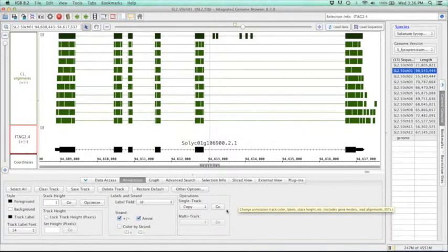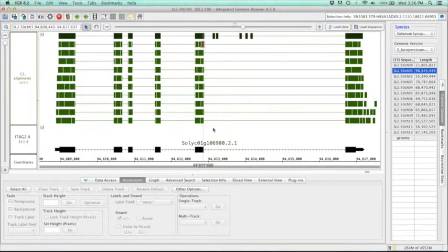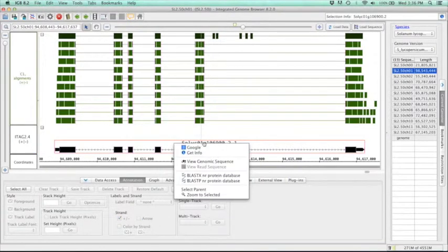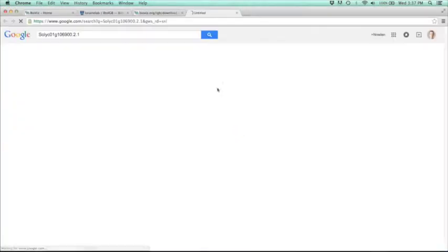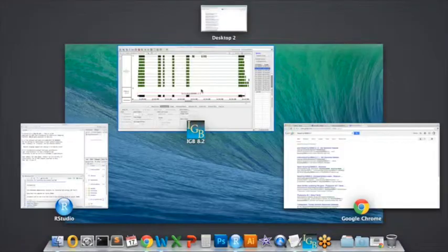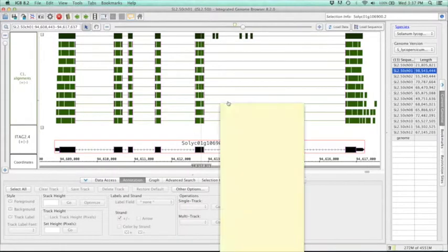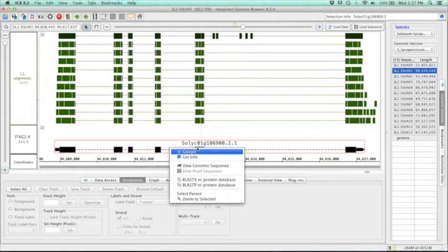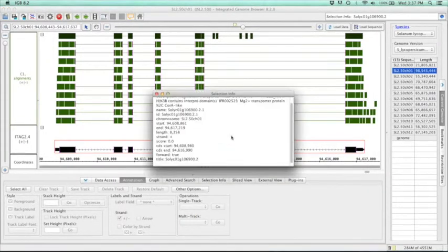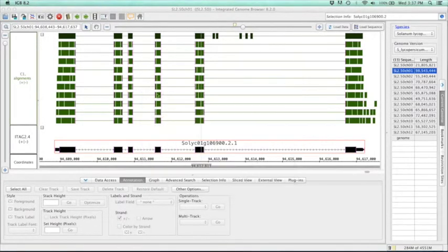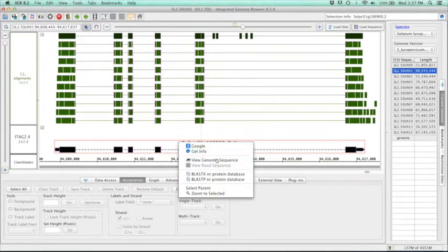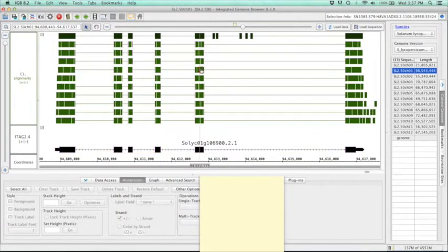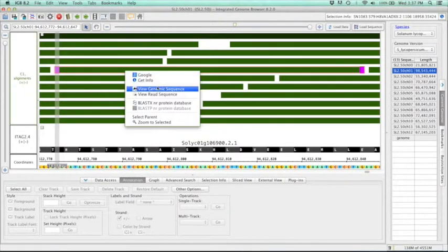Now you can also get more information about the gene or reads that you're looking at by right clicking on them. So we've revamped this menu to make it even easier to find information. So clicking on Google will search Google for that gene of interest. You can also right click and get info, which will give you a very similar list of information as to the tooltips themselves. And then you can also look at the genomic sequence, or if you're looking at a read, you can also look at its specific read sequence.